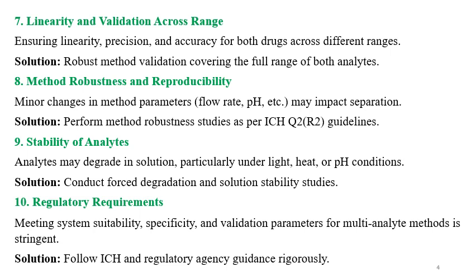Ninth one is stability of analytes. Analyte may degrade in solution, particularly due to the effect of light, heat, pH or oxidation. Solution is conduct forced degradation and solution stability study to understand the degradation mechanisms and to come with the solution to prevent this. Tenth, regulatory requirements: meeting system suitability, specificity and validation parameters for multi-analyte method is stringent. Solution is to follow ICH and other regulatory guidelines completely so that regulatory problems will not be challenging.